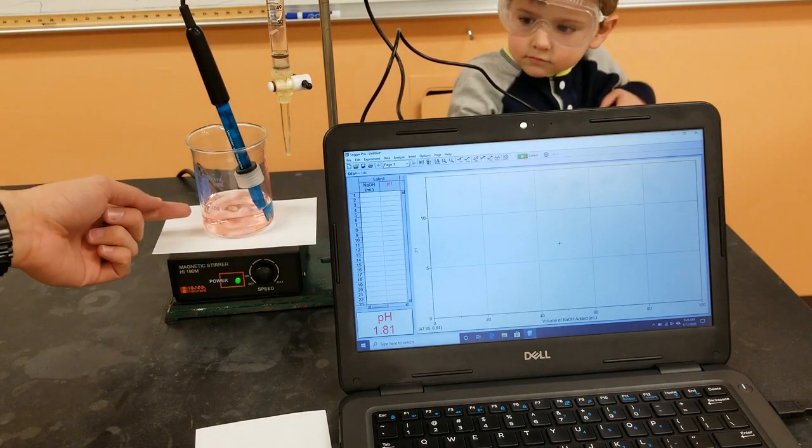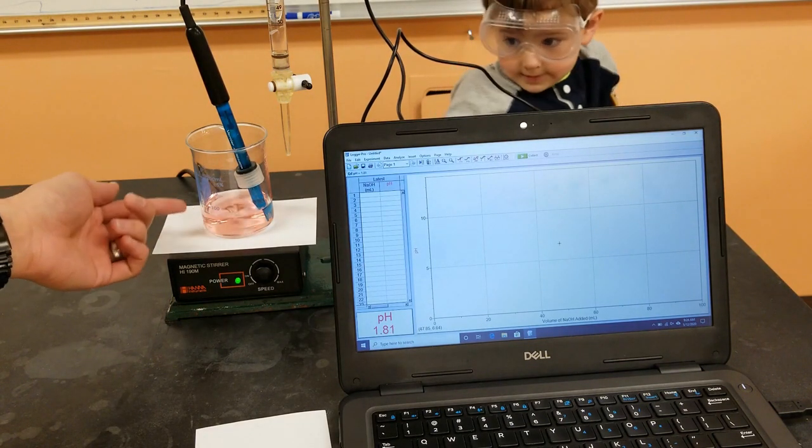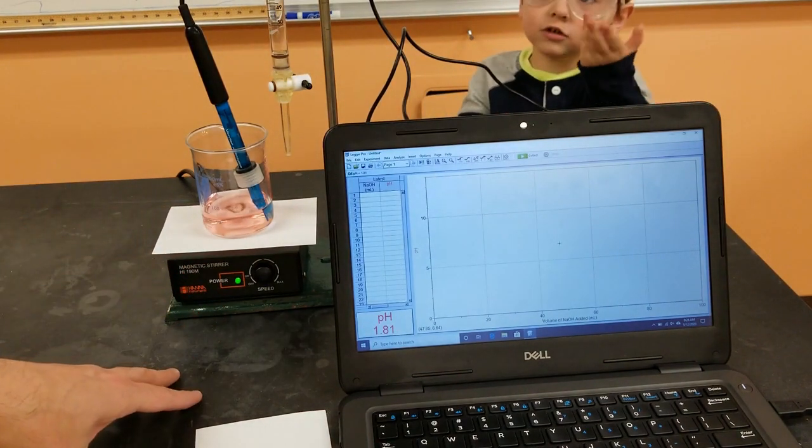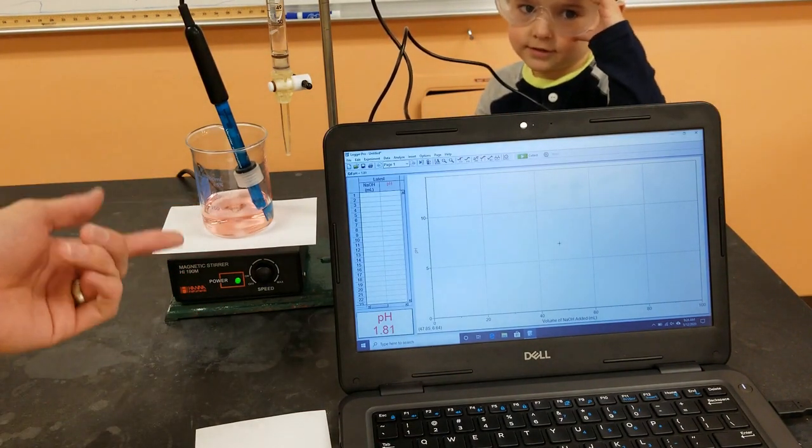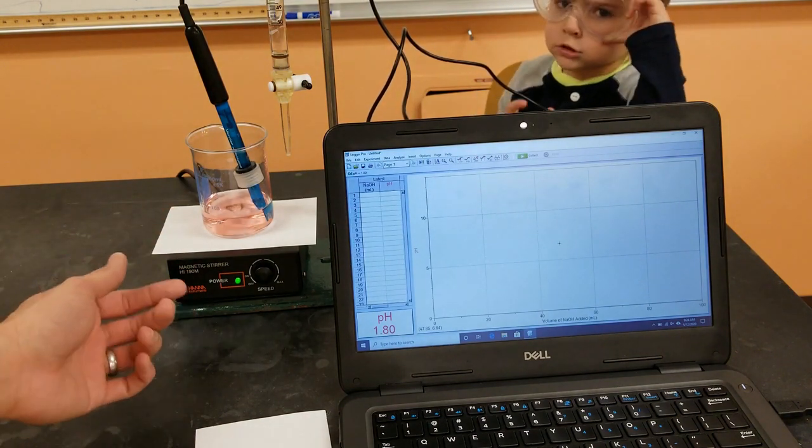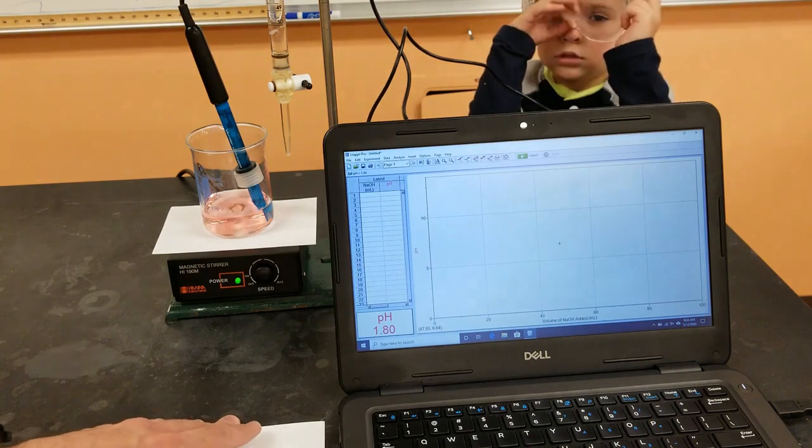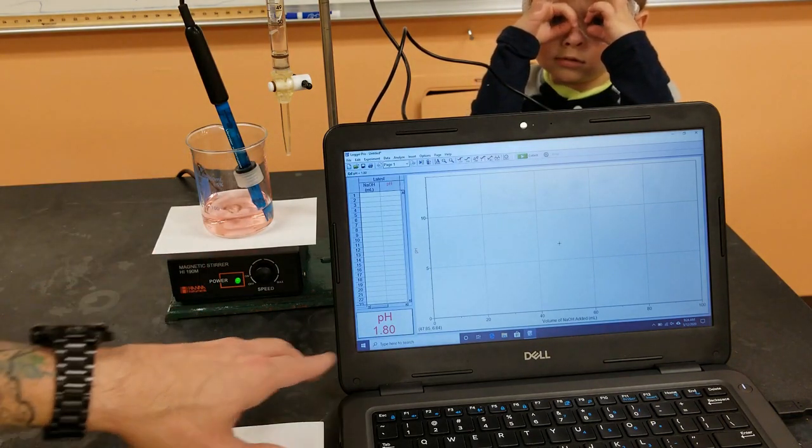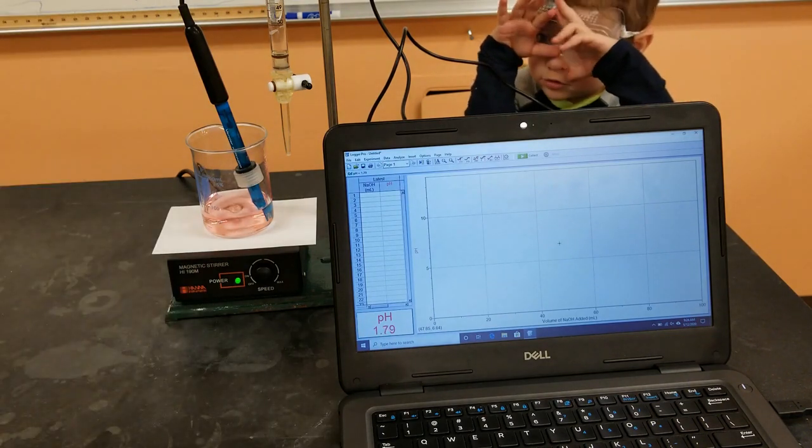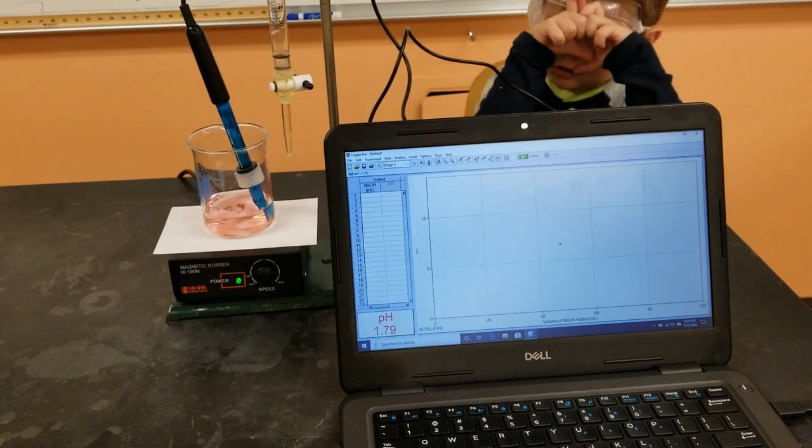Okay, so we've added indicator. It turned red. We added universal indicator, so red indicates very acidic. And then the first pH probe I was using was reading a pH around 9, so it was not calibrated. And so I just switched it out with another one, and it's reading a pH of 1.80. I made sure that our volume today is going to start at zero on the base burette.